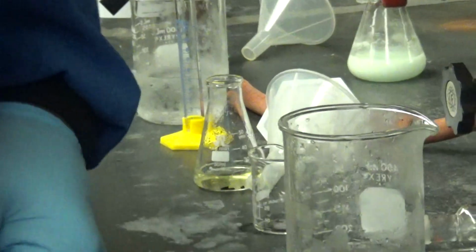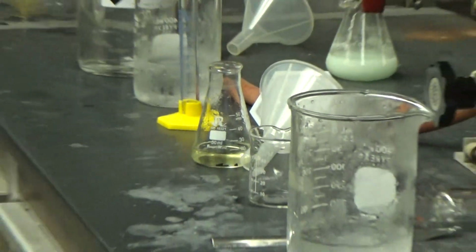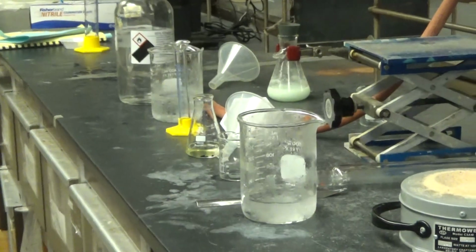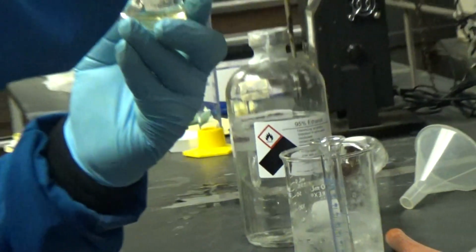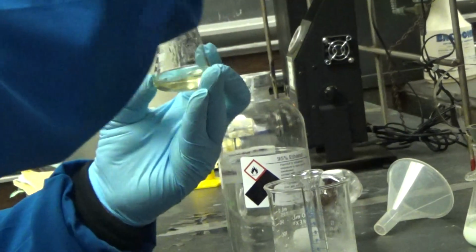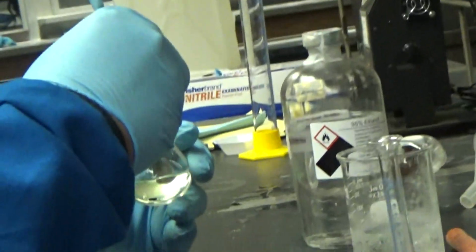Boiling stone out. We're still waiting on this stuff to cool down a bit, and hopefully we'll get some crystals. You got a spatula? So you're trying to scrape it, or what are you doing now? You're getting rid of the boiling stones?